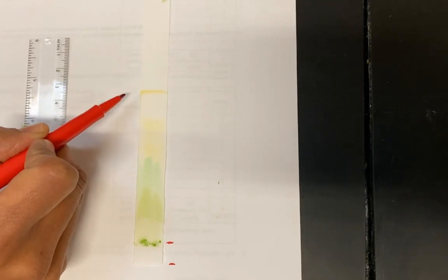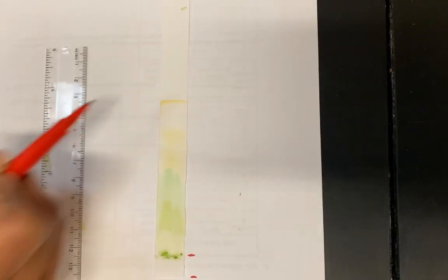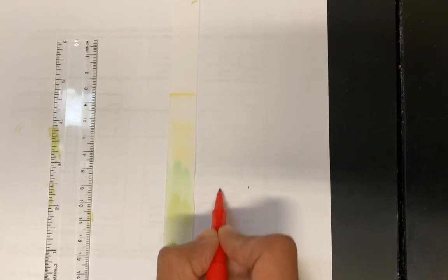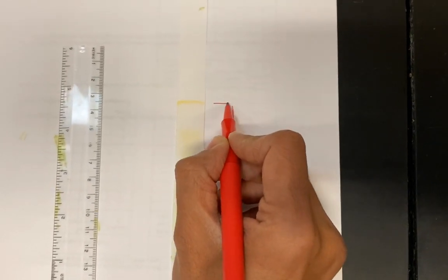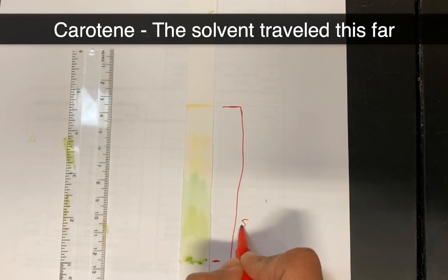So if you look in your lab, you'll see the different pigment names and the carotene moves all the way to the top. So first I'm going to draw a line to show that the solvent moved from the bottom all the way up to where the carotene is. Okay, so that's my solvent line.